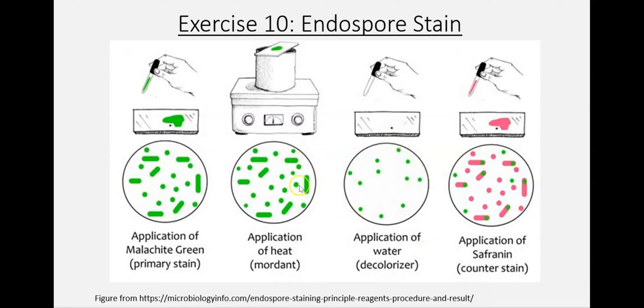That comes out really easily, and then at the end, because the cell bodies are colorless as a result of the decolorizing, we will use another basic dye solution, safranin, to counter stain the cell bodies so that the bodies of the cells are visible and we can also determine whether or not the spores are inside or outside of the cells.